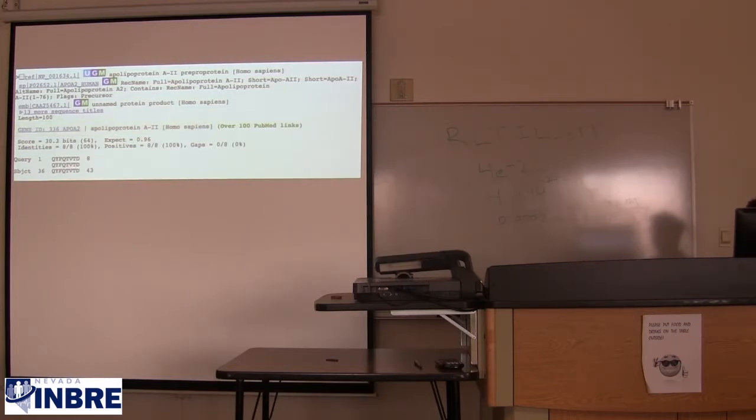I mentioned in part 1 of the companion video that at NCBI we use a cutoff of 1 times 10 to the minus 6 for some internal processes using BLAST-P against the BLAST-NR database. But that may be too restrictive for your purposes.